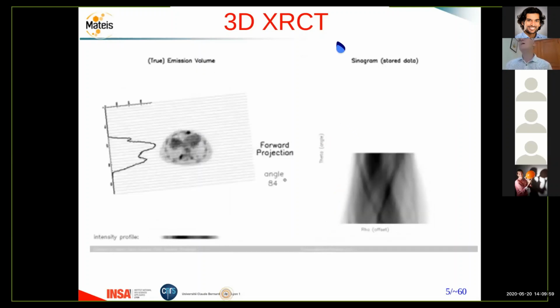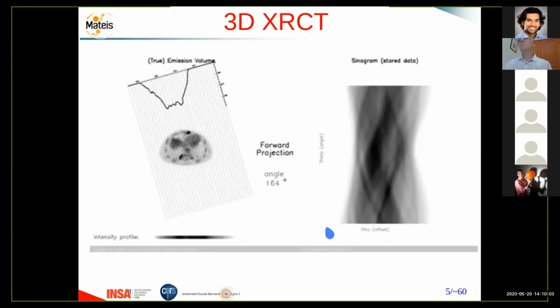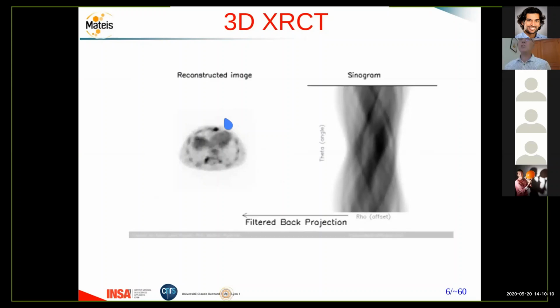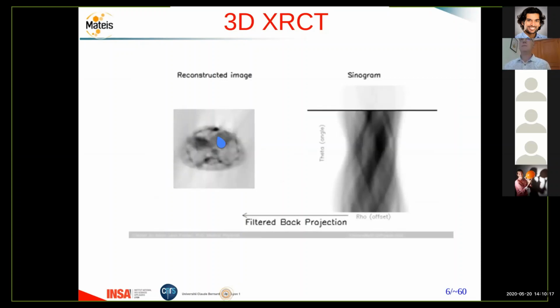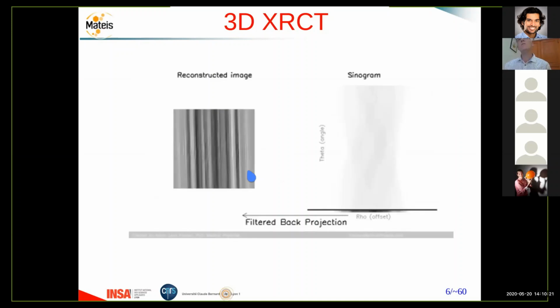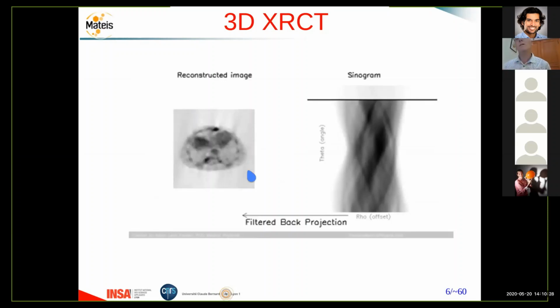So if you are able to obtain a sinogram like this, you will be able to back project, to filter, back project, and Fourier transform your sinogram and magically reconstruct the image of the attenuation inside your slice, okay? So this is the principle of all these methods. It's non-destructive, it is quite fast. You just need to record some radiographs and you can obtain the image of your microstructure of your material.